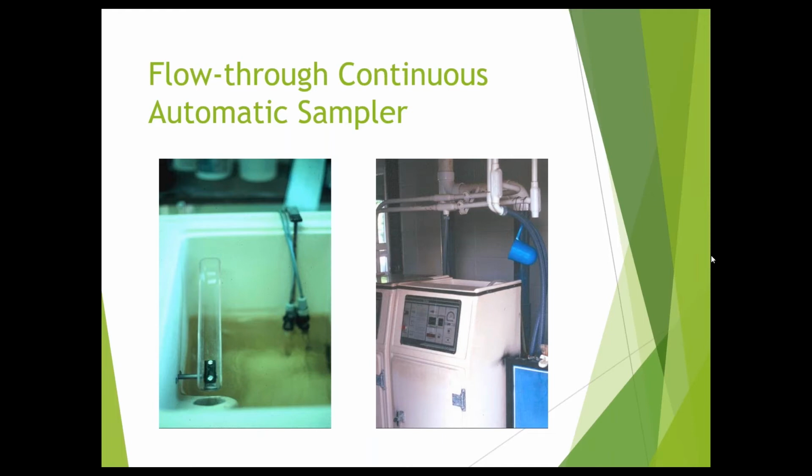And on the left, in the top of it, there's a housing where water is continuously pumped into it. So wherever you're pumping from, that's continuously pumped into this upper chamber. And that arm that you see, it dips down and up continuously. And it takes about 5 to 10 mils at a time. And it just continues to dip down and up, down and up, until the sampling period is over.